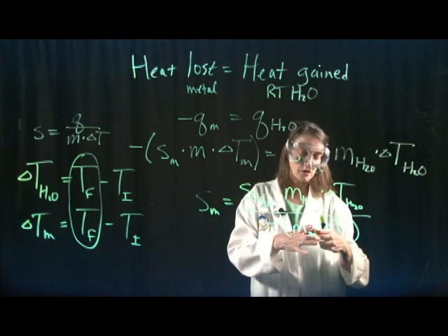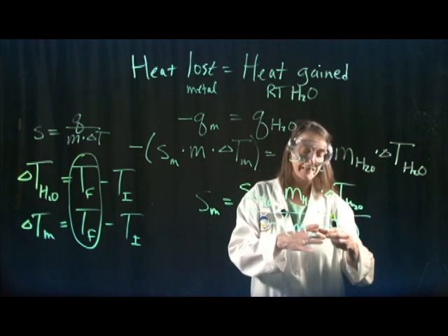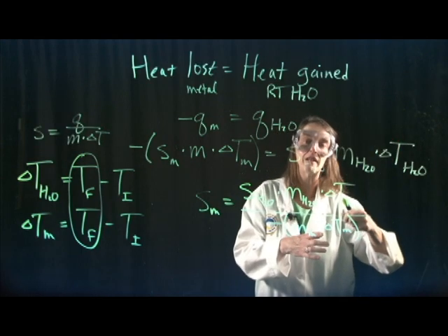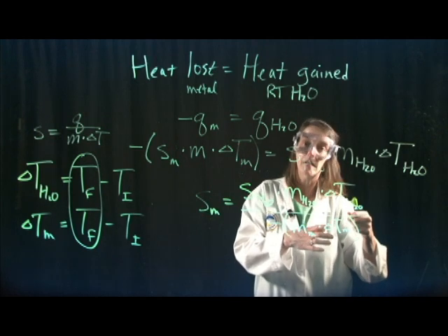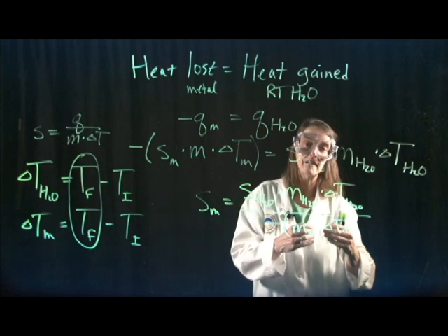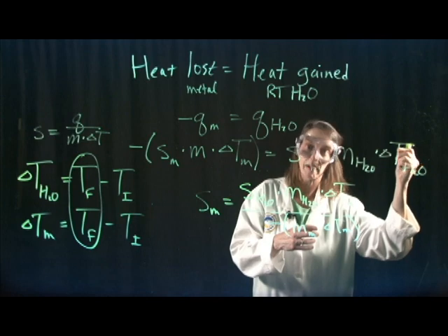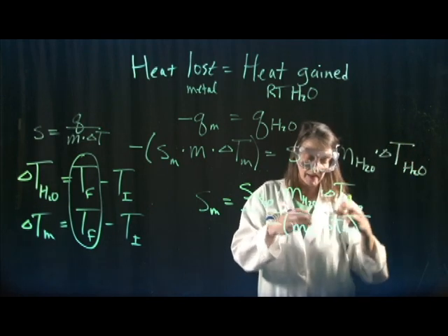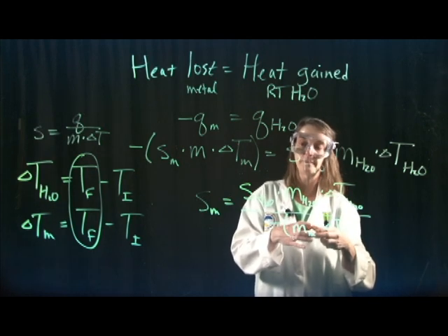If the temperature goes up whenever you dissolve the solid, you are releasing heat to the environment. Remember that temperature probe is part of the environment. So if the temperature goes up, that is heat released, and we would say that's exothermic. If the temperature goes down instead, that means that heat is leaving the environment, your temperature probe being part of the environment. The heat is leaving the environment and going into the system, and that is therefore endothermic instead.